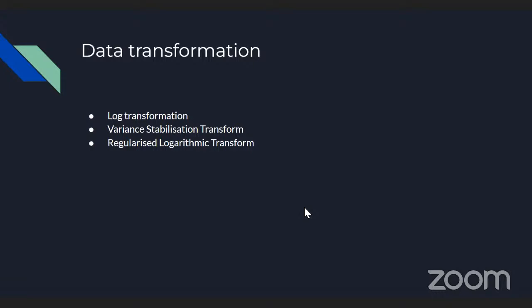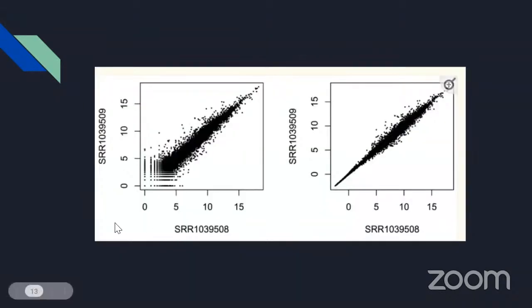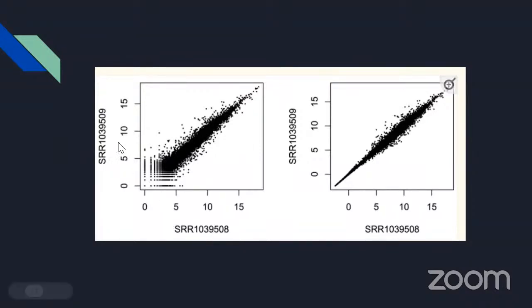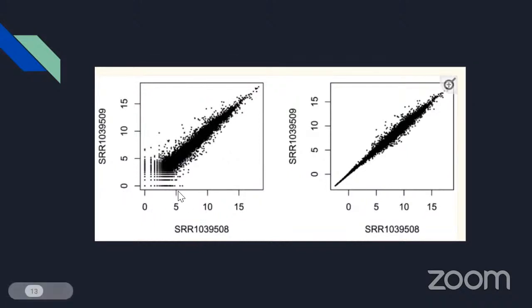When you look at two samples, such as SRR508 and SRR509, and look at the spread of gene counts, we can see there is very high variance when counts are low. Whereas in the case of very high counts, we don't see a lot of variability between the two samples.